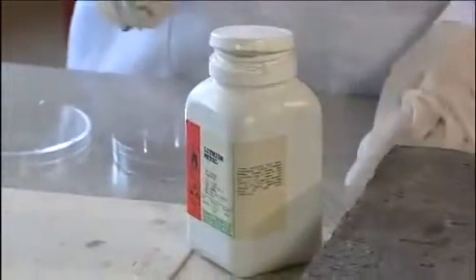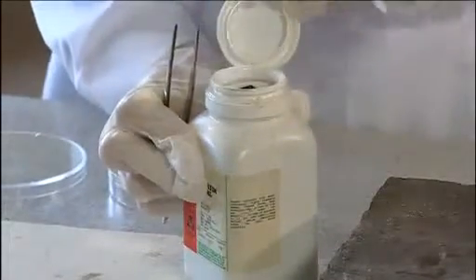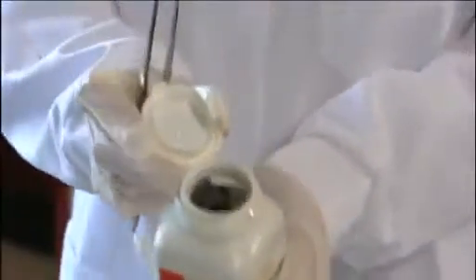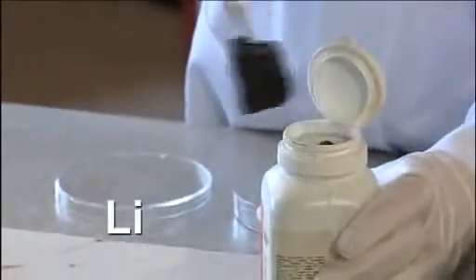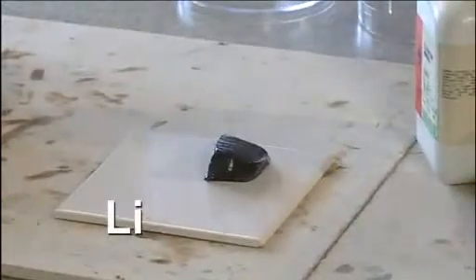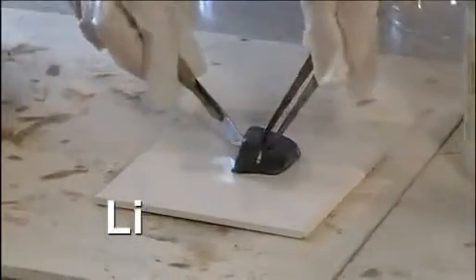In preparation, we need to cut some of the metal, and this is an ideal opportunity to show some of the physical properties. First of all, you should point out that all the alkali metals that we're using are stored in oil. Take some of the metal out of the container using some tweezers and place on a tile. We're going to cut a small amount of the metal off this large chunk.